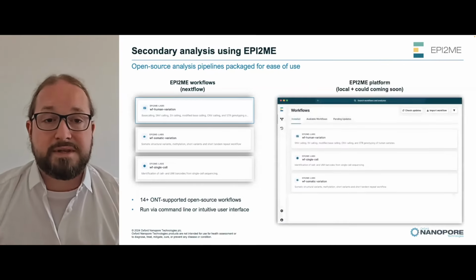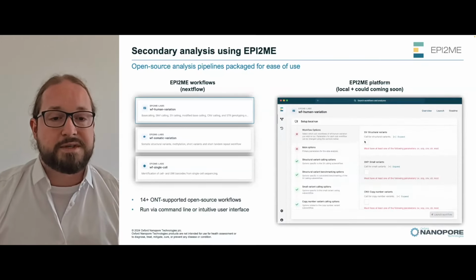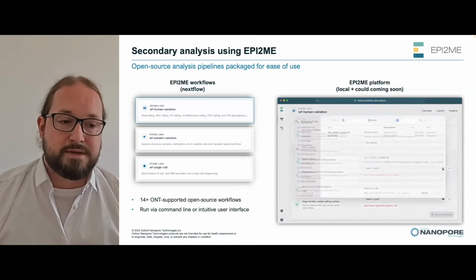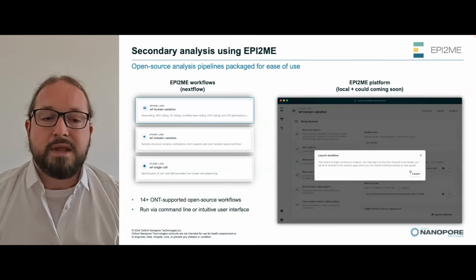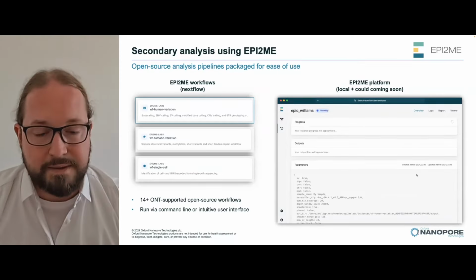The other part is the platform itself, which basically gives you a UI that can load all these workflows and will give you a user interface where you can input your sample name, your files, whatever analysis or parameters you want to specify. And then you can launch the workflow through that UI. And at the end of it, you'll get HTML reports and the output files. And this is just briefly shown here on the side.